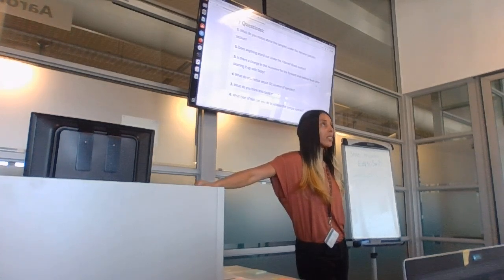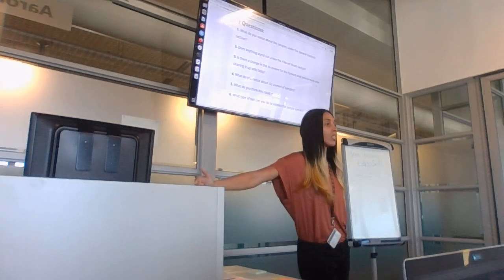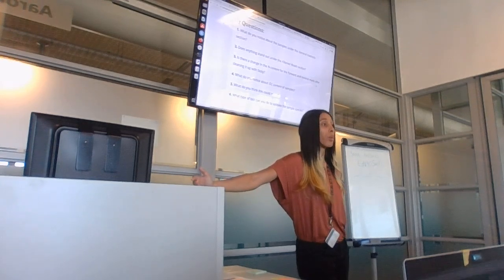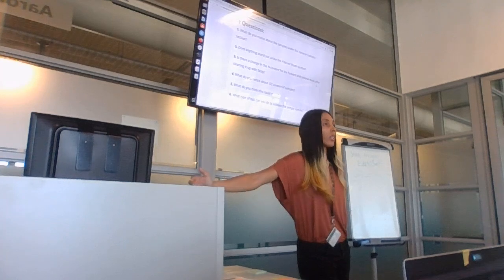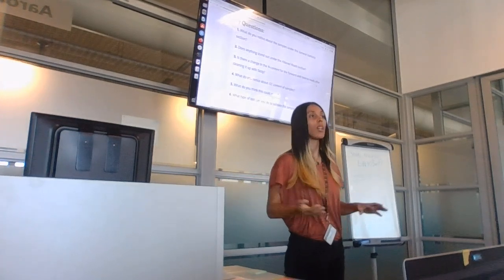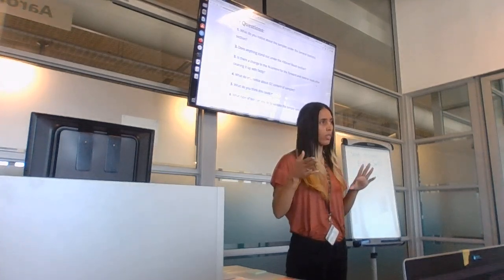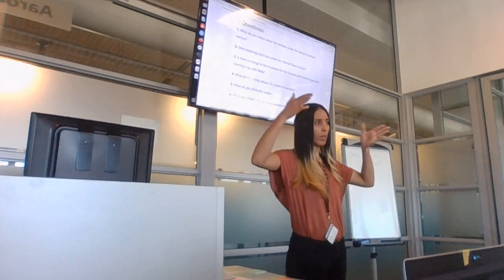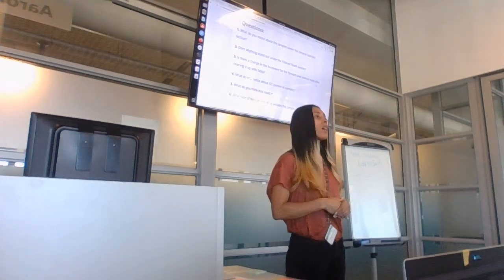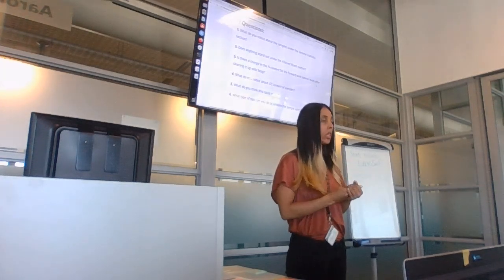It's basically saying, tell me what the quality of my data is, what the lengths of my reads are, what the GC content is, how many ambiguous bases there are, whether there are adapter sequences, how much, and what they are, what the individual base qualities are at each position, and also how much duplication is in my sample, for example.